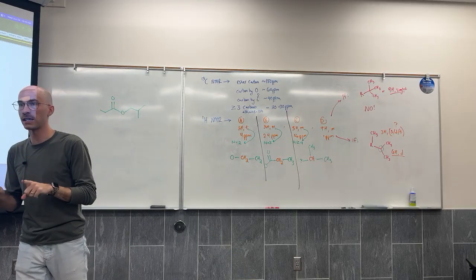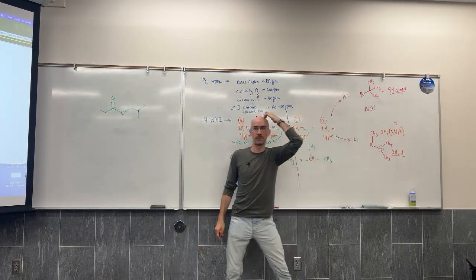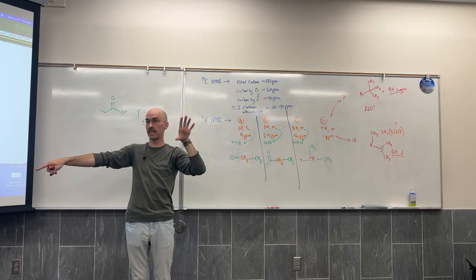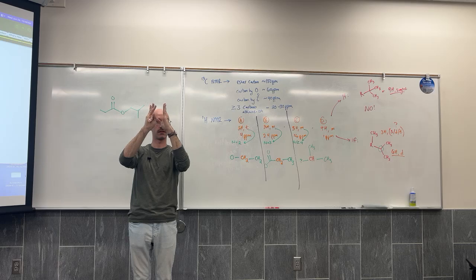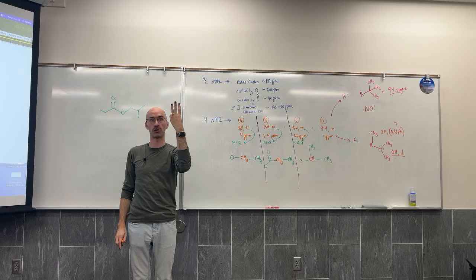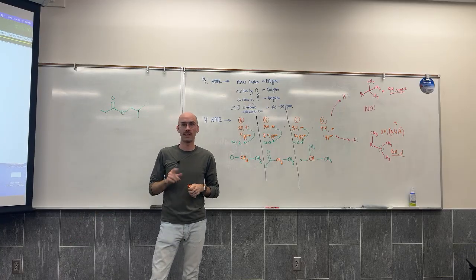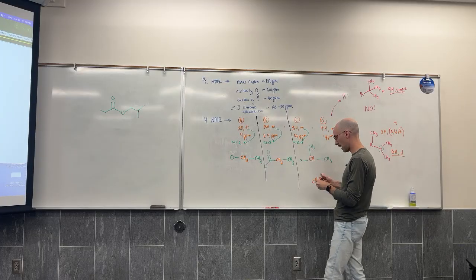When you see 3H, I've kind of trained you to think first of it as a methyl group. If it's a methyl group, that means there's only one group connected. If the group connected is a CH, then the methyl signal shows up as a doublet. If the CH3 is connected to a CH2, then the methyl group shows up as a triplet. So how do you get something ugly and messy like this multiplet? It's not a 3H. It's the overlap of a CH and a CH2.